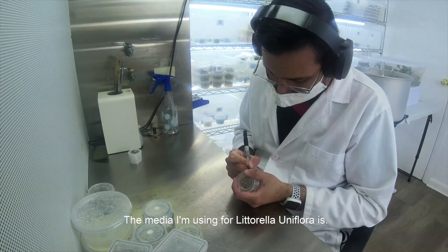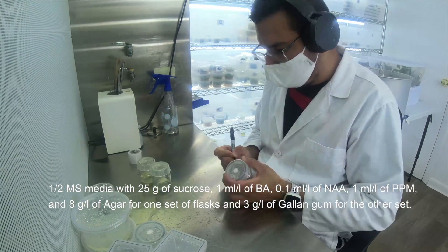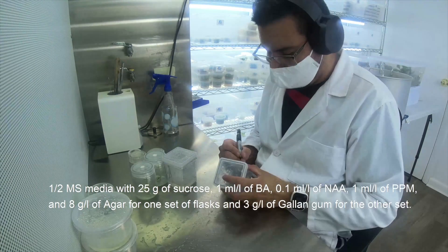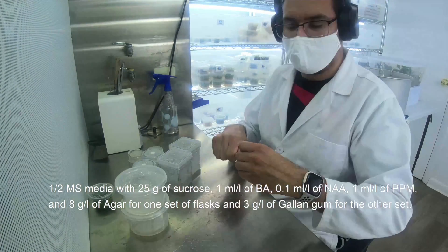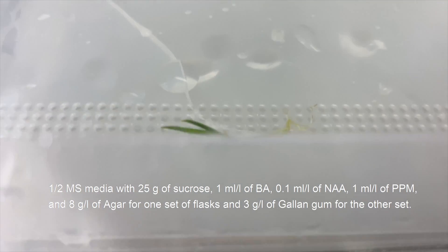The media I'm using for Littorella uniflora is 1/2 MS media with 25 grams of sucrose, 1 mL of BA, 0.1 mL of NAA, 1 mL of PPM, and 8 grams of agar for one set of flasks, and 3 grams of gellan gum for the other set.